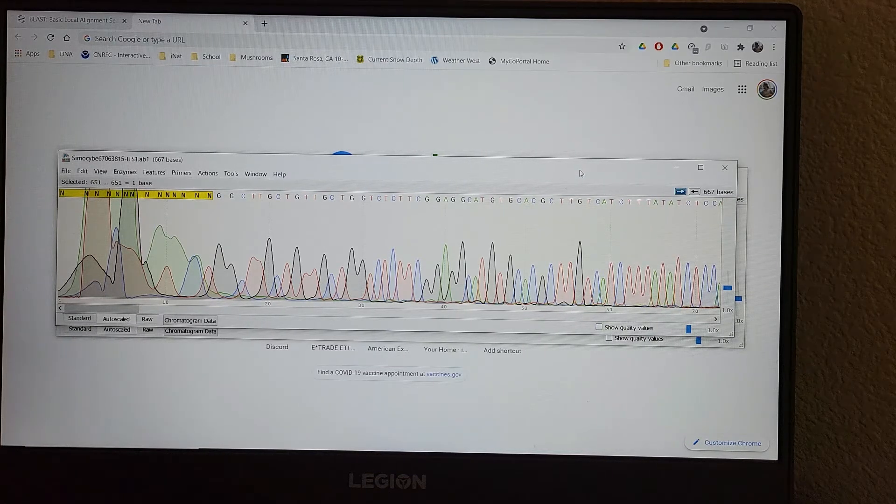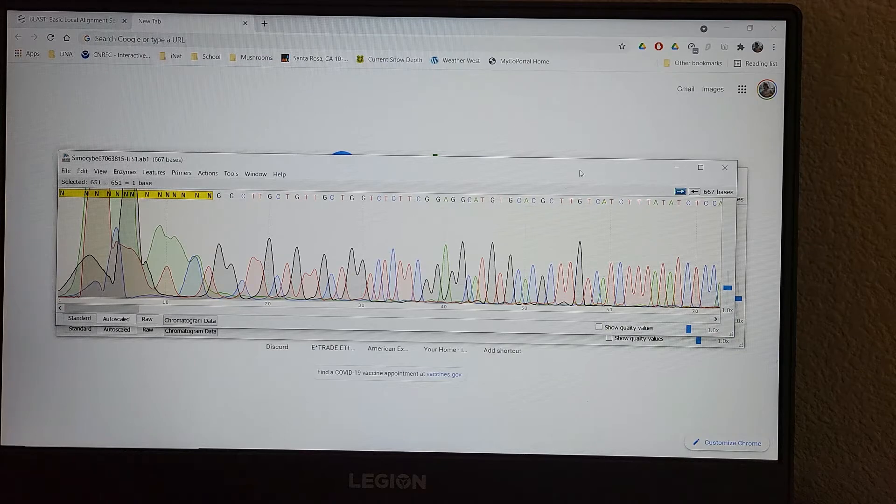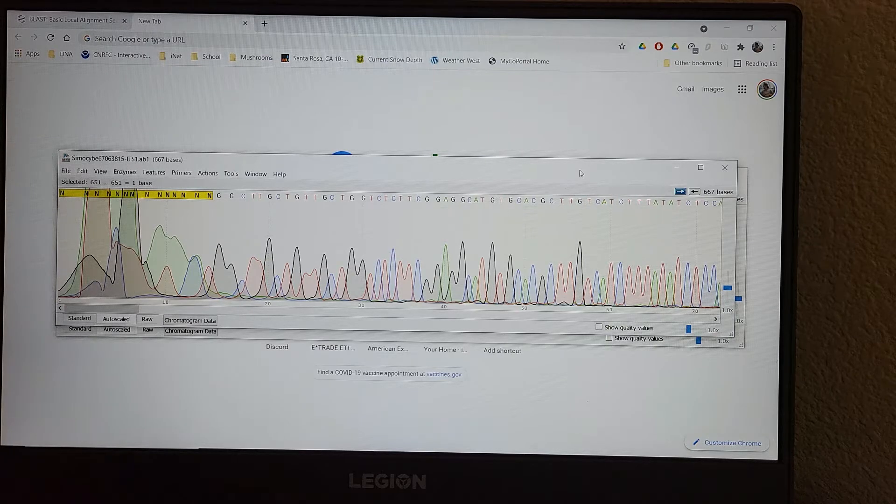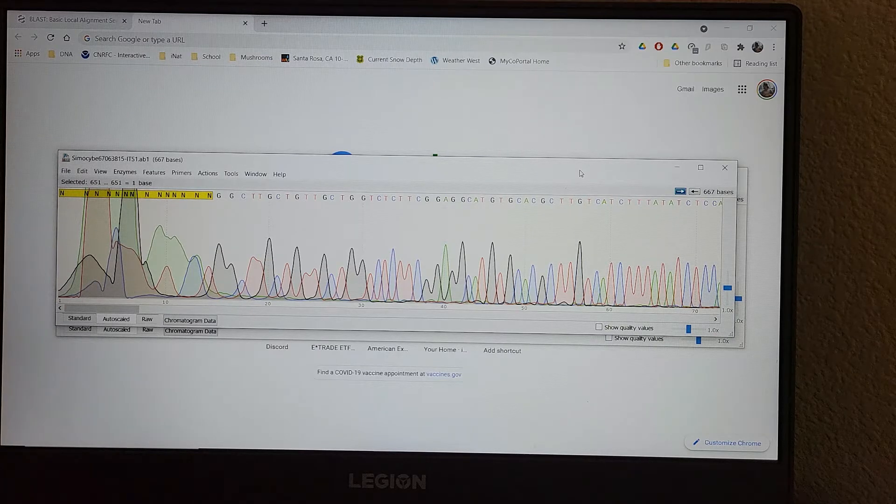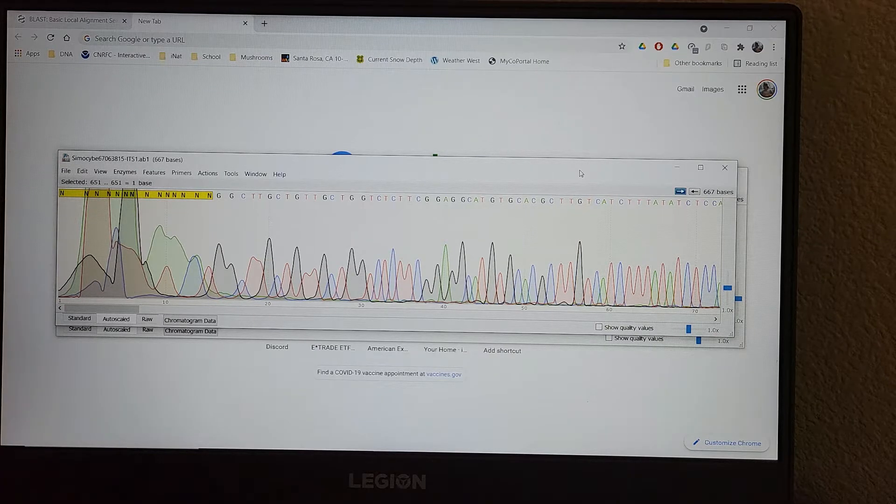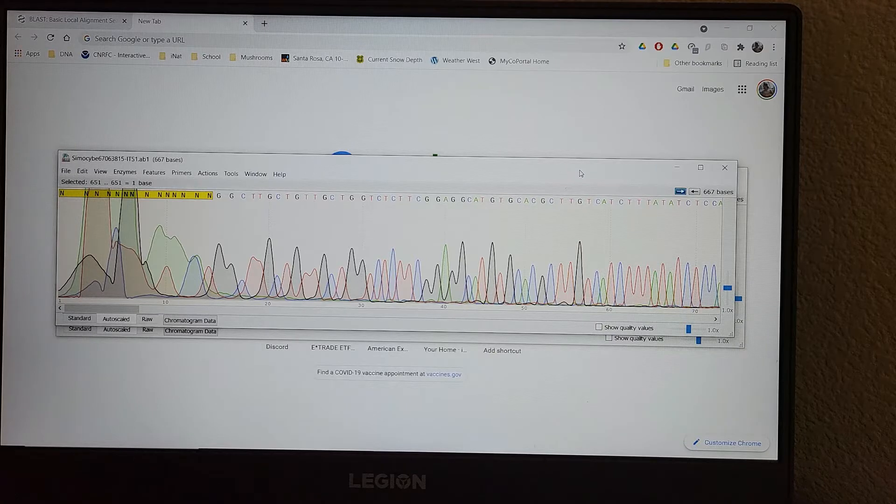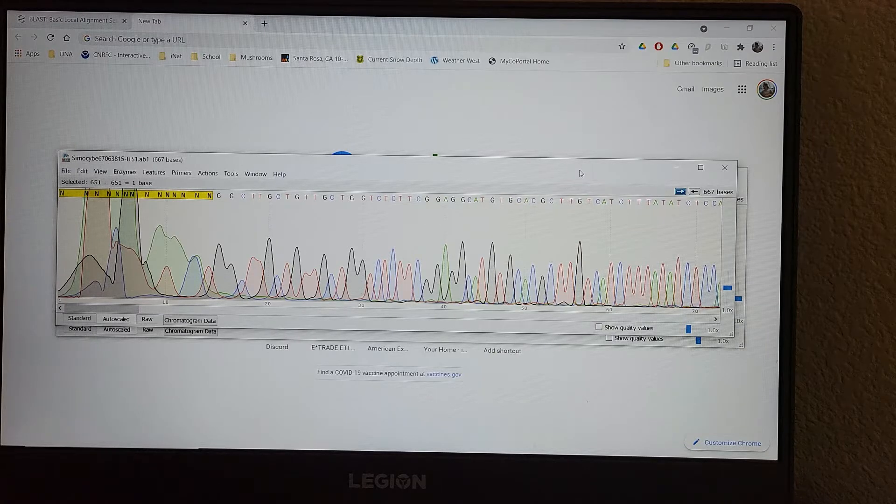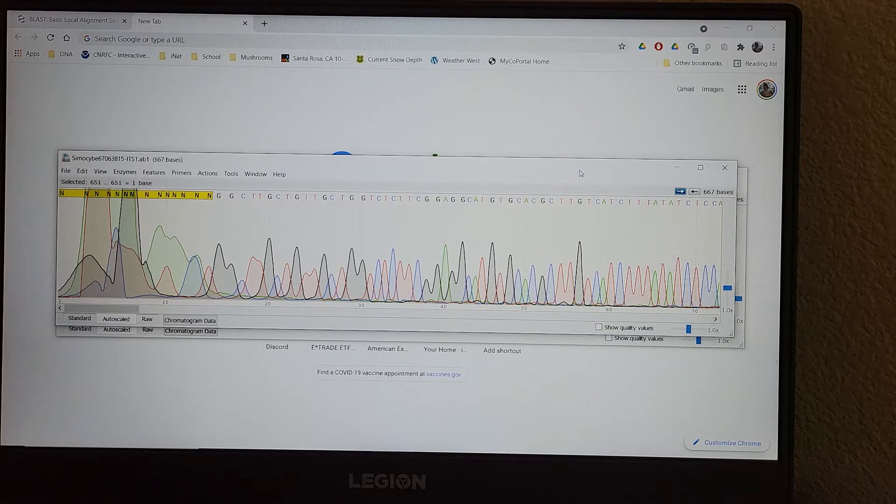Okay, so I'm going to go over the data analysis part of it now, and I'm going to use some example sequences because I don't have the sequences from this PCR run back.